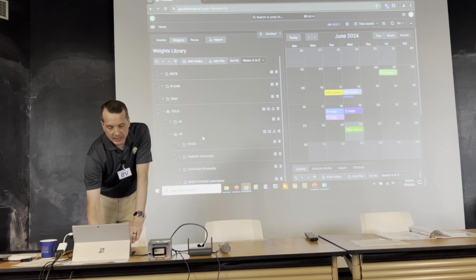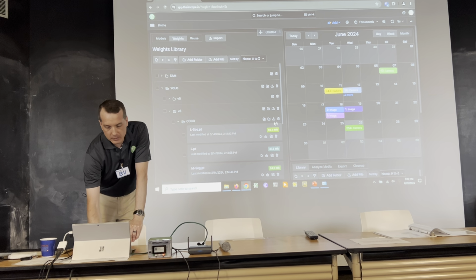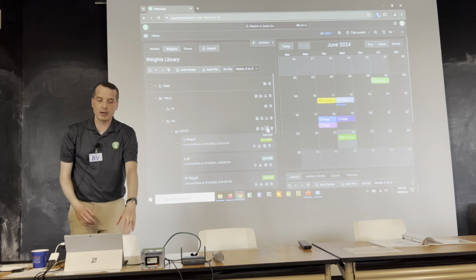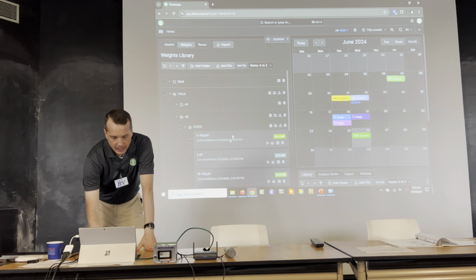But we have a variety of models. We can organize this. If we don't see a model we like, we can upload one. And this is all through the web browser because it's running off of the web server that's on this device here. And we can go ahead and start a model.